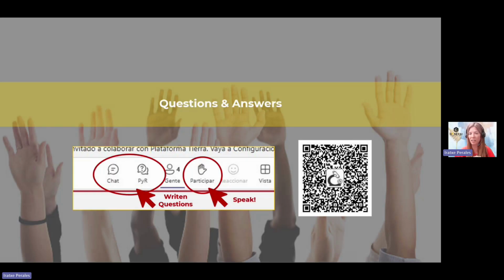We have 110 until now. I think that Intertech showed that they have 200. So we still have some species not yet trained, but we are about to do it. Everything is public. We have also, in the Spanish webinar, shown the accuracy explained by the University of Córdoba, directly from palynologists.